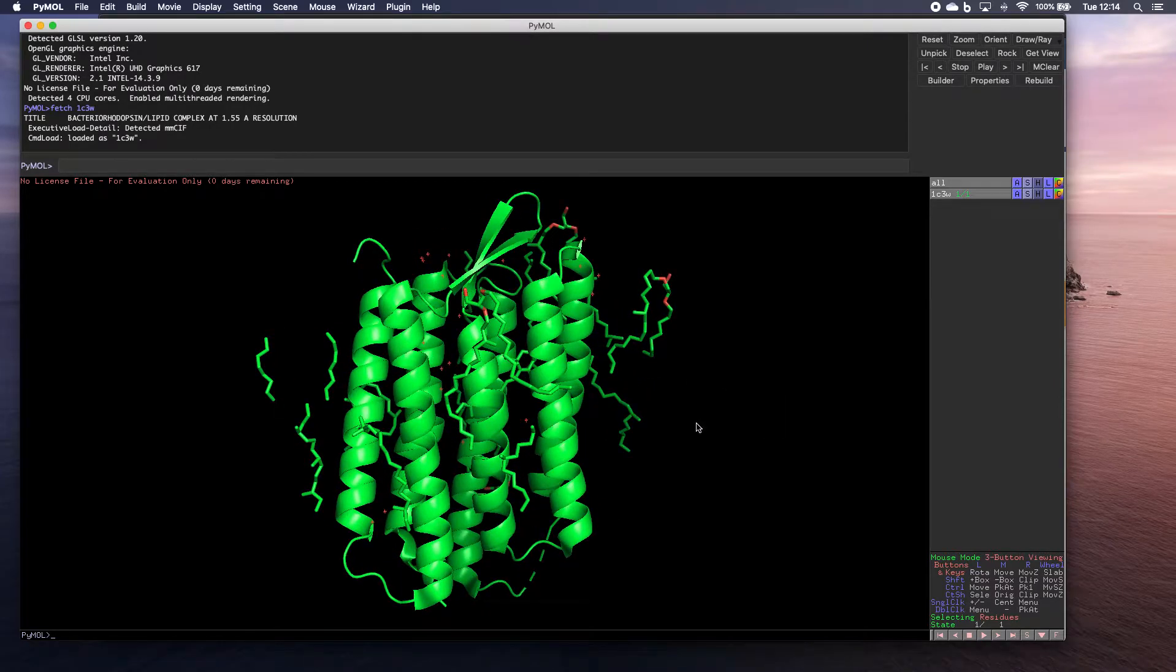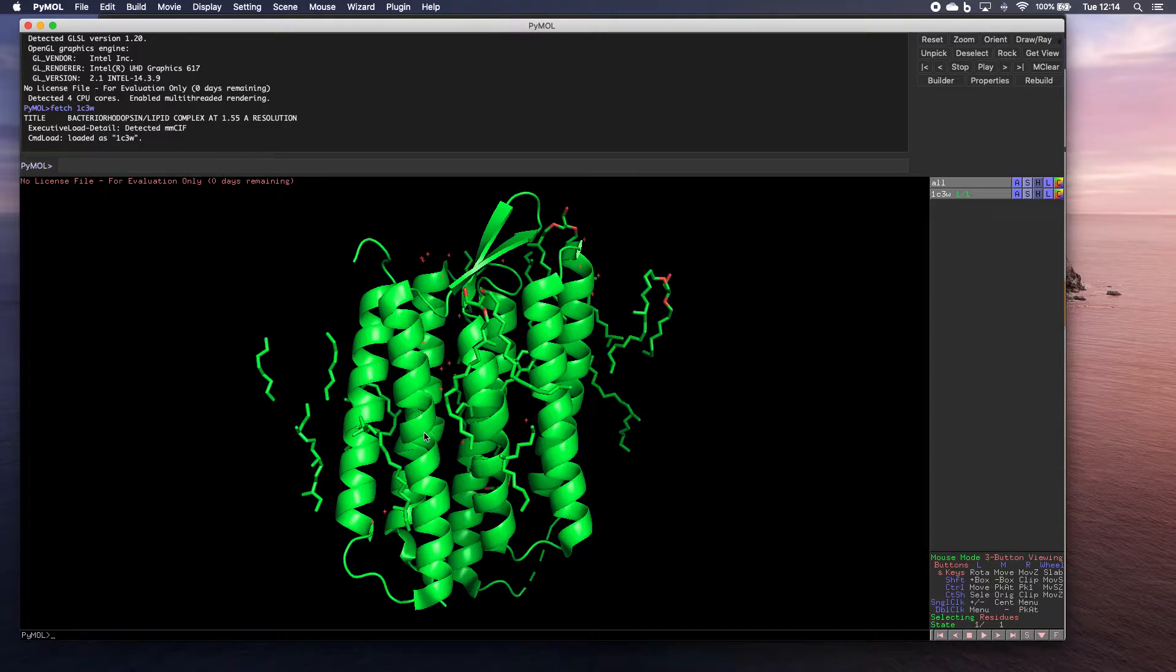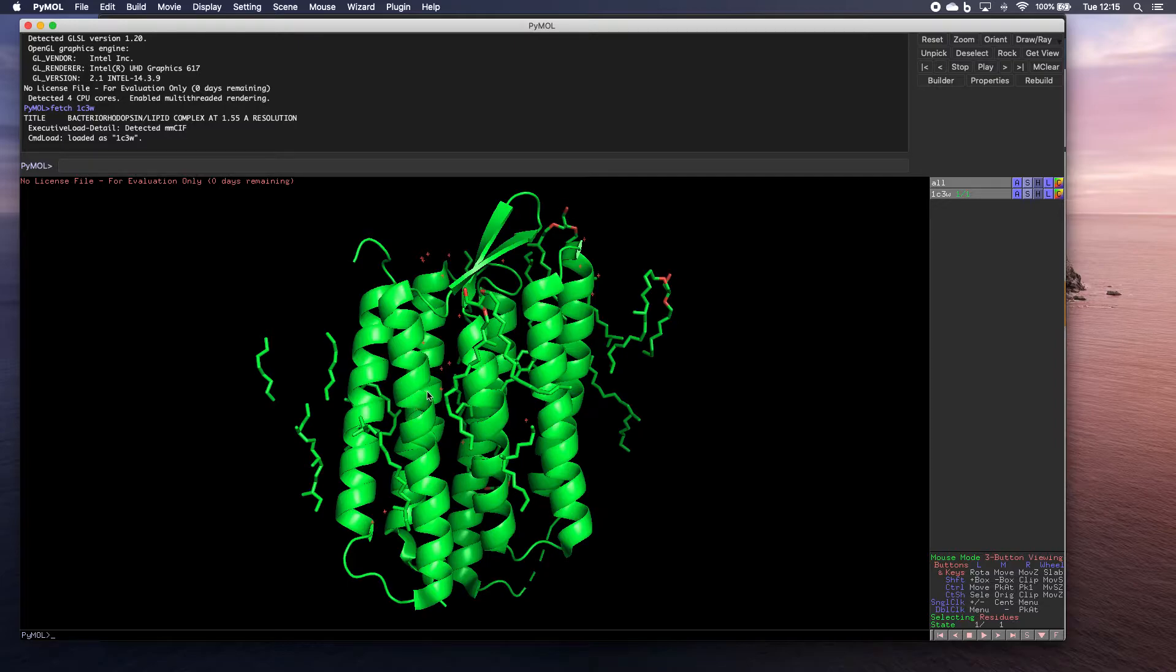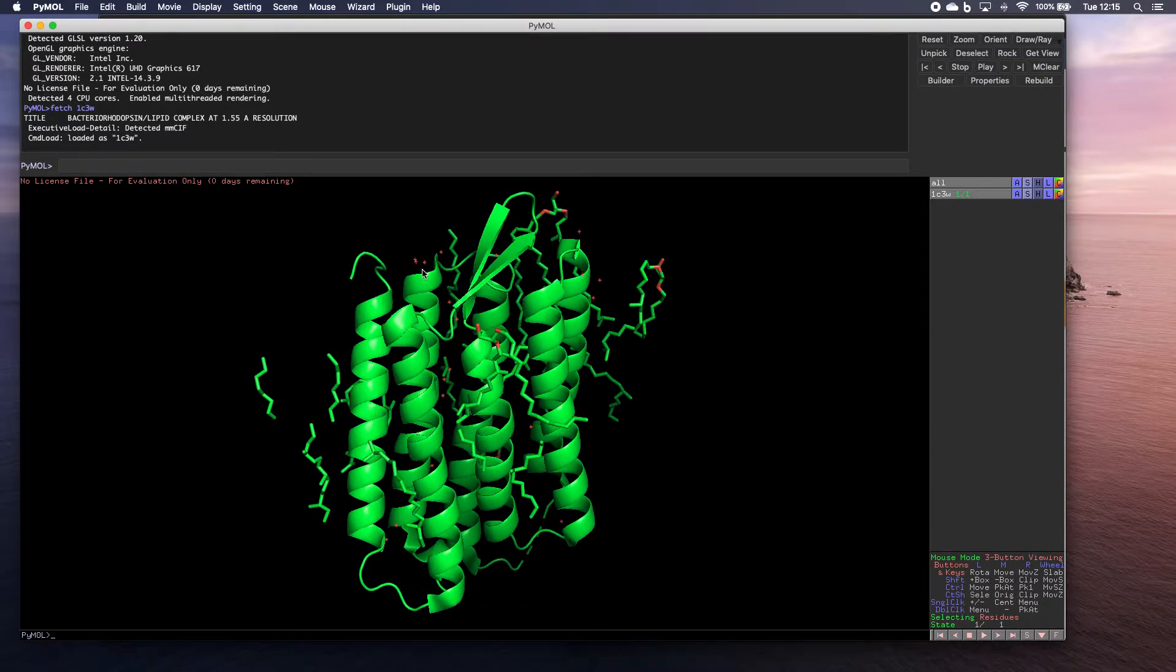Now, what we see here, we've got these nice alpha helices and so on. We've got these things over here, which are those other ligands and structures associated with it. We've got these dots here. Now, these are water molecules.